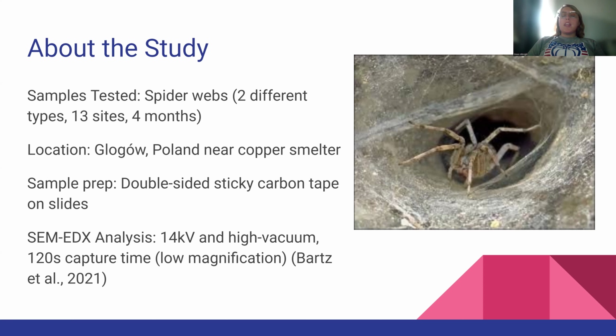So when they collected these samples, they took the spiderweb samples and put them on a sterilized petri dish, being very careful not to fold them, as that would have complicated the data and provided inaccurate results. When taking the spiderweb samples, they applied them to a slide that had been prepped with double-sided sticky carbon tape.